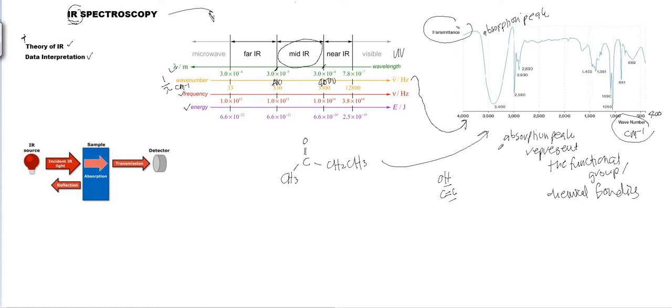Okay, because each of these we call it as a functional group ataupun each of this bonding, okay, require certain energy to vibrate, right? Because when we talk about the IR, we always talk about the vibration, right? Jadi dia memerlukan, okay, frekuensi yang tertentu, the specific frequency to vibrate. Jadi apabila dia memerlukan frekuensi yang tertentu, so each of the functional group will be having its own frequency, right? Contoh dekat sini kita tahu apa, dekat sini apa. So each of the molecule pun masih benda yang sama.